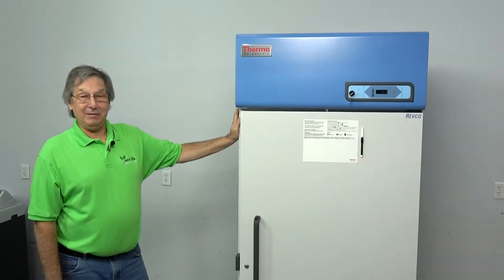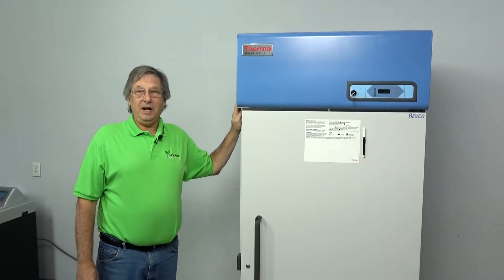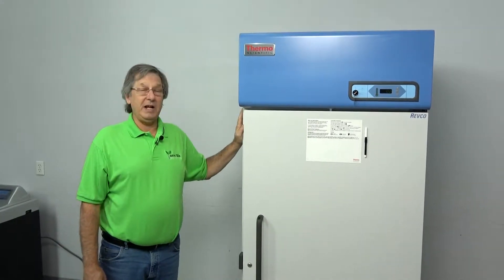Hello, welcome to New Life Scientific. My name is Steve. Today we're showing the ThermoScientific Revco UGL 2030A ultra high performance negative 20 freezer.